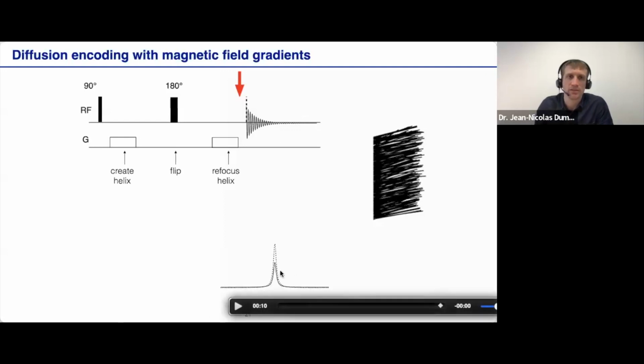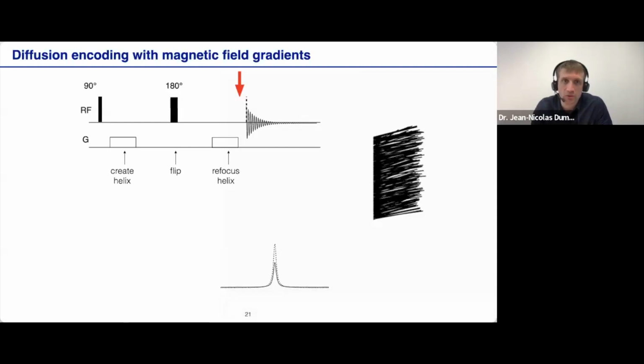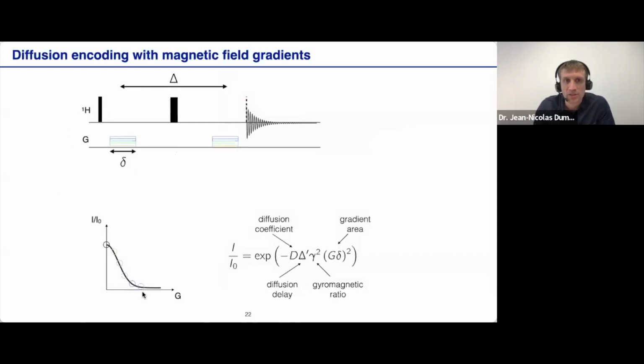And this attenuation is actually what we want to measure in diffusion NMR, and in DOSY, the way in which it's done experimentally is by running the pulse sequence a number of times for different values of the gradient amplitude, which provides a decay curve that can be fitted with the Stejskal-Tanner equation to recover the diffusion coefficient for each peak, given that the different delays and amplitudes are known experimentally, are under the experimentalist's control.